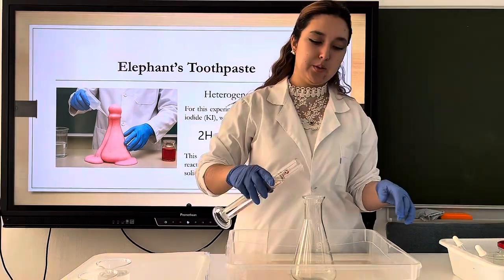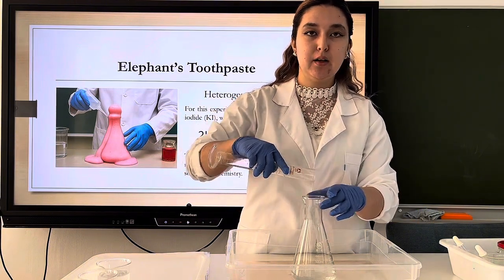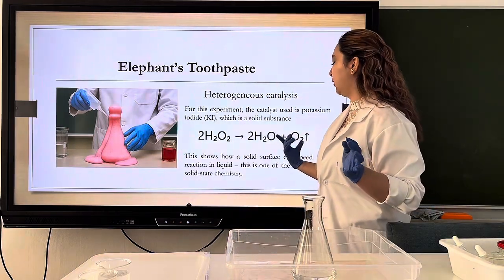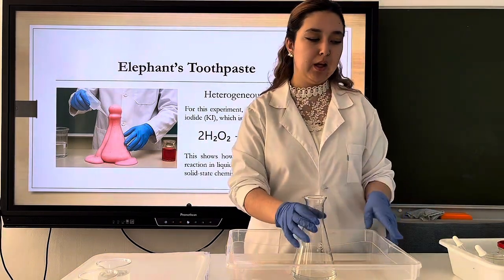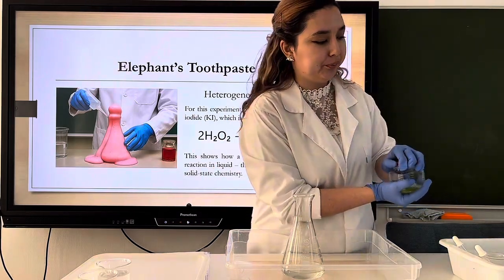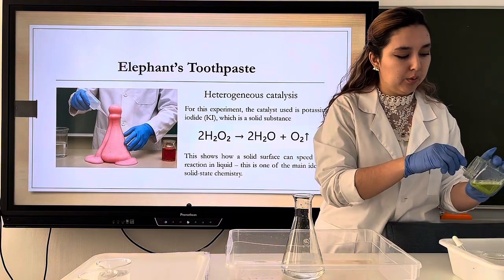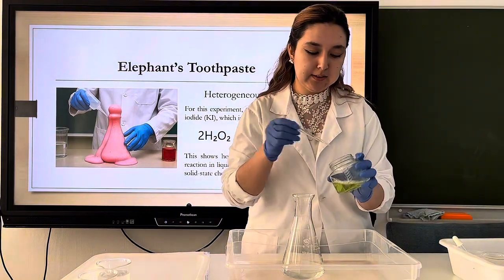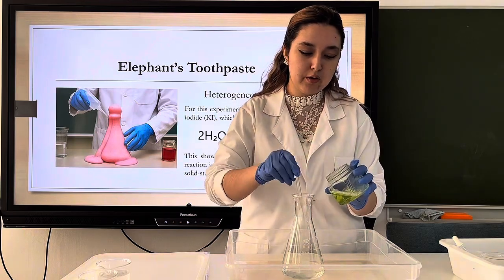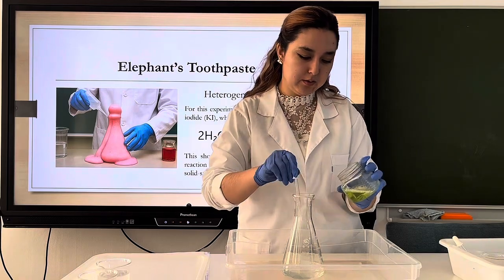So let's start. Normally hydrogen peroxide breaks into water and oxygen very slowly if we just leave it open. So when we use a catalyst, the reaction becomes much faster.